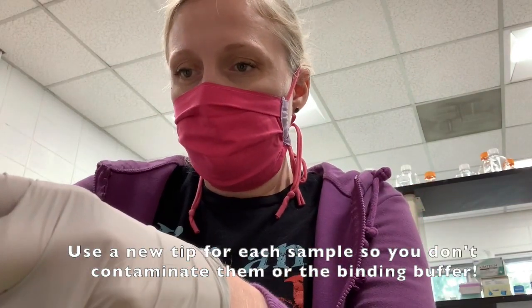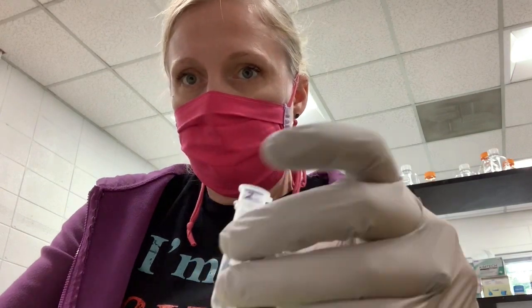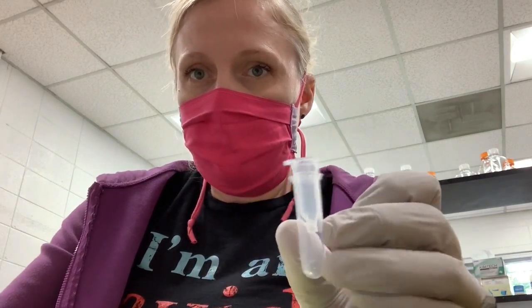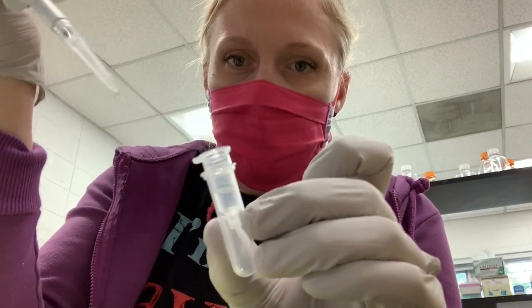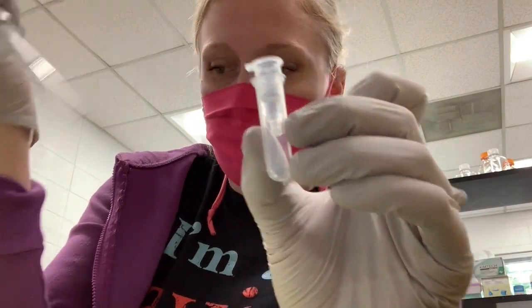So I'm going to do the same thing for all of my samples, where I add the DNA binding buffer to the PCR tube, I don't let it overflow, and then I just pipette it into the column. I'm holding this up, you can just leave it in a rack, but I just wanted to show you that I'm just pipetting this in there, and that will just sit on that column.